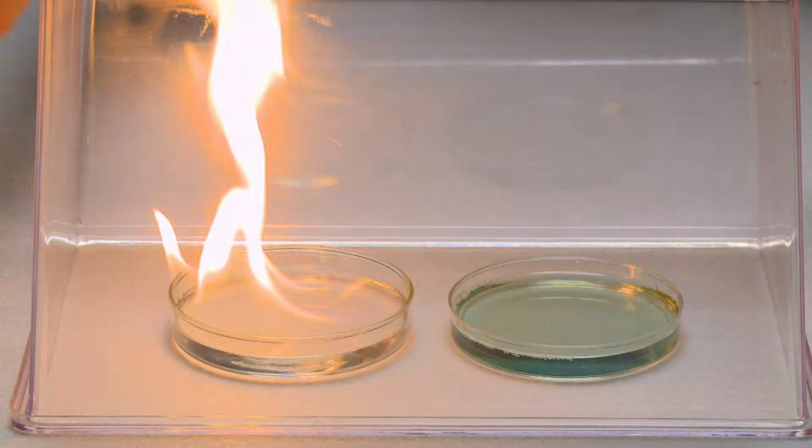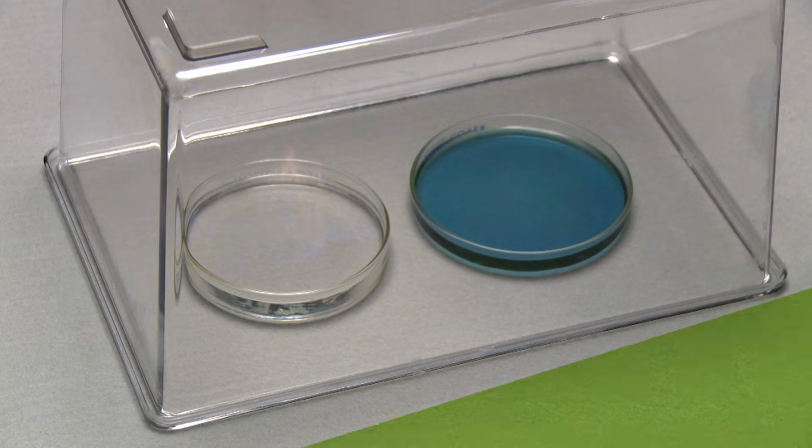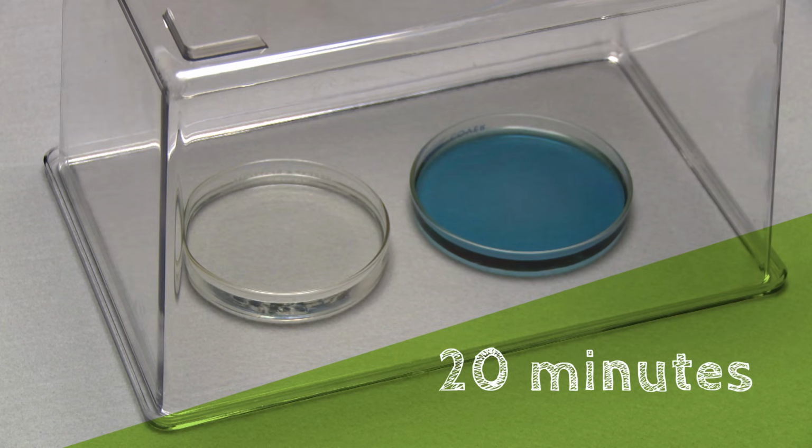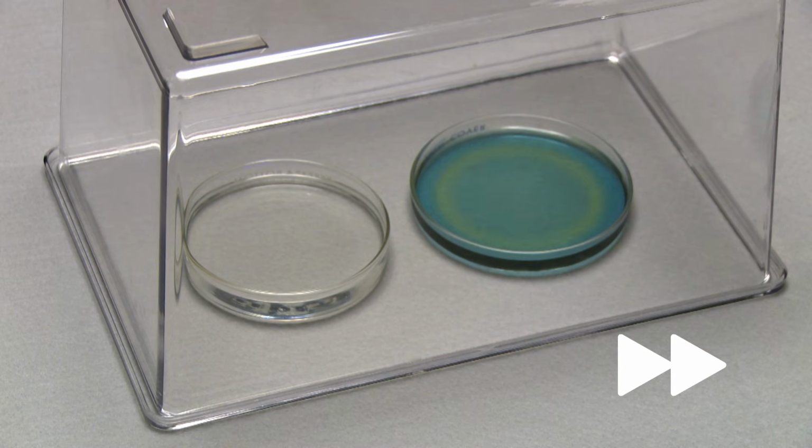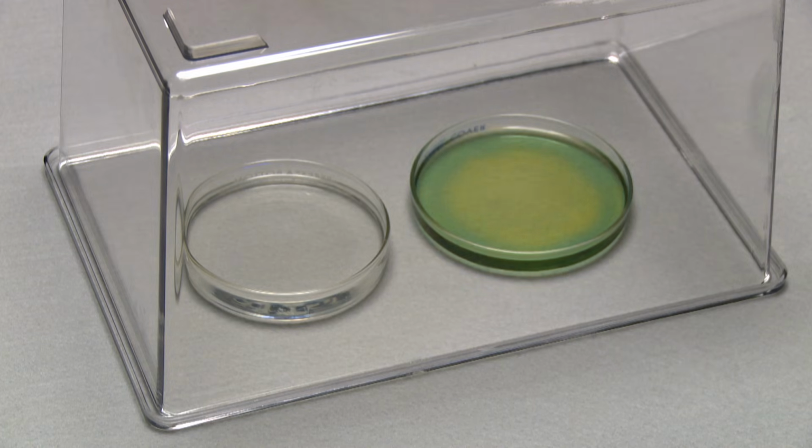The flame goes out pretty quickly. After about 20 minutes, we can check for mass changes and color changes inside the container. Let's speed this up a bit. You can see that after 20 minutes, our BTB is pretty yellow.